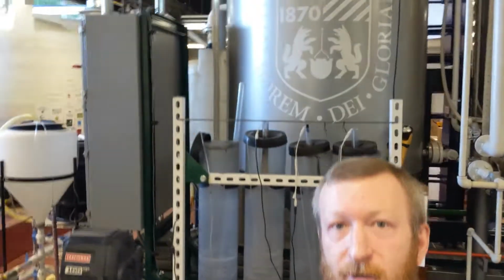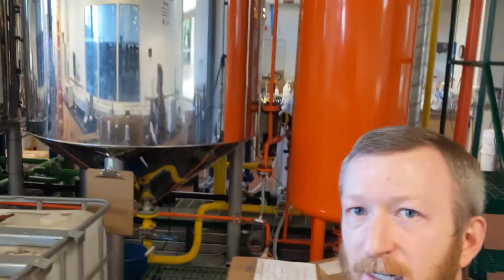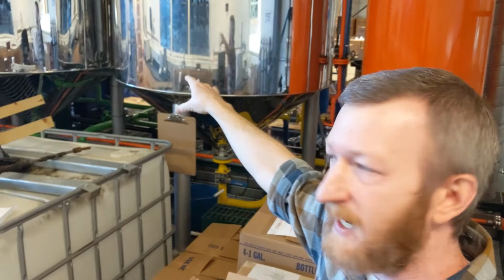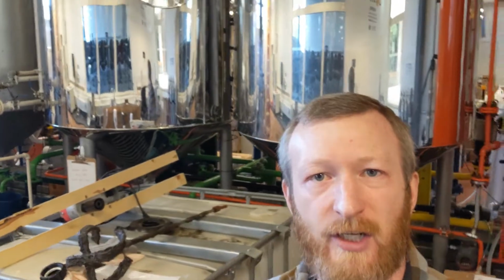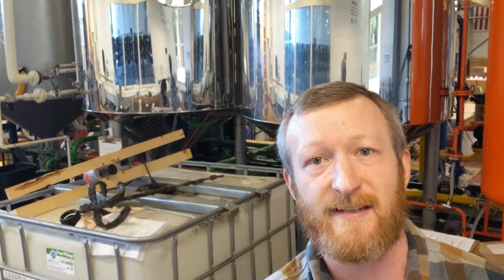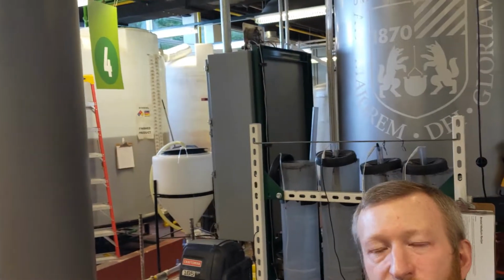So here's another view of the reactor behind me, right? That's the wash tank. As we walk this way, there's the methanol recovery tank, and this first tank over here is the biodiesel tank. These first two tanks, this reaction tank and the methanol recovery tank, they've got a shiny insulation cover on it. Those are heated processes, so those are heated tanks, and they're insulated, and the shiny stainless steel cover you see is an insulation cover. The wash tank down here at the end that has the Loyola crest, that's not a heated process. We want the heat to dissipate at that point for that to work really well. And so we let the heat dissipate out of that. It's not insulated, and so that's why it looks a little bit different.